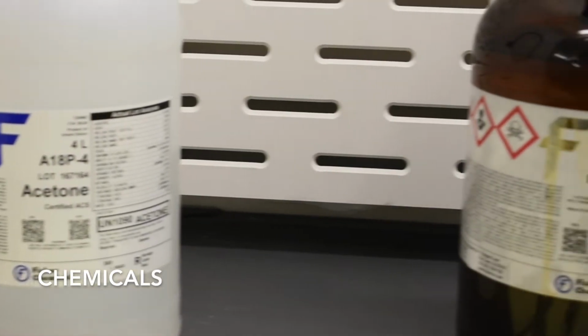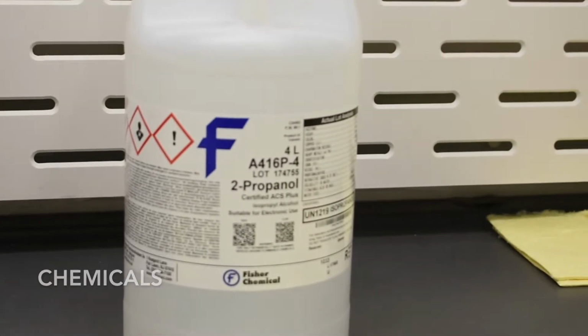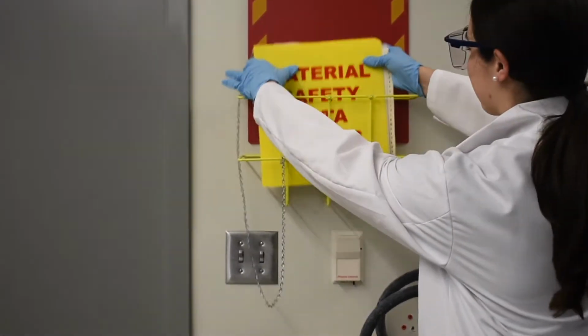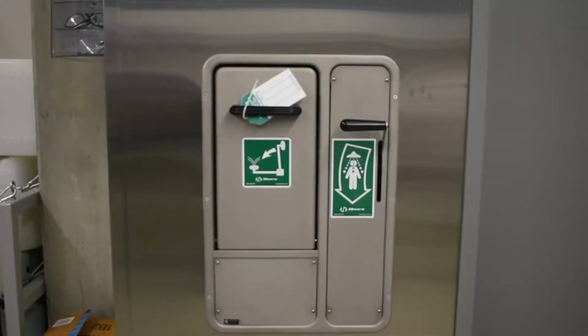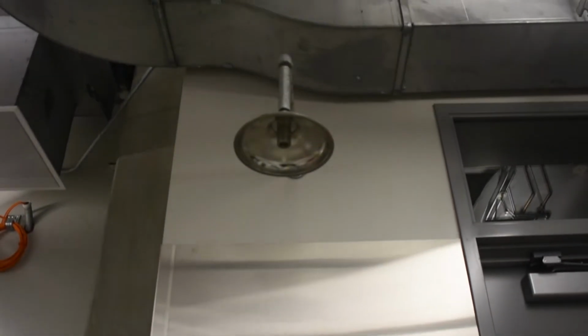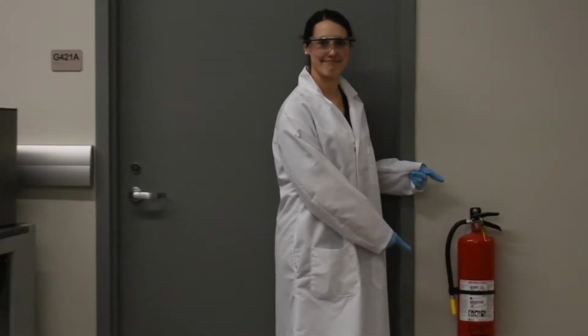One of the hazards in this experiment was the chemicals being used. It is important to consult the MSDS sheets for potential side effects and first aid procedures. In case chemical exposure does happen, note the location of the safety shower and eye wash station. It is also important to know where the fire extinguisher is located.